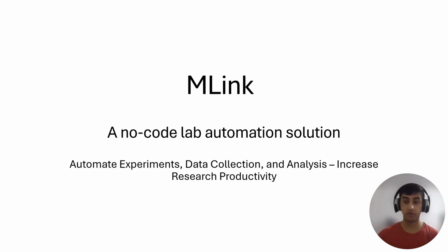The problem started with my own research. I wanted to get more work done, but I just didn't have enough time. So I started to automate my experiments, automate the data collection and the analysis, and these three things led to an increase in my own research productivity.